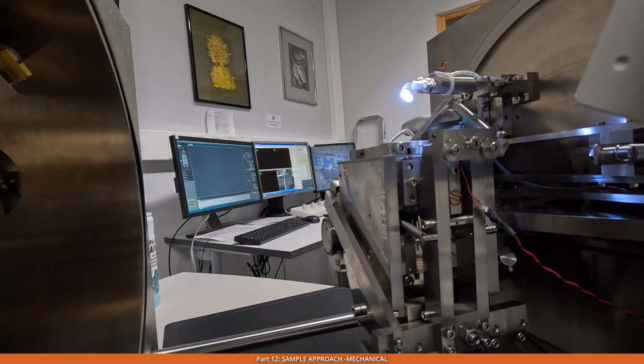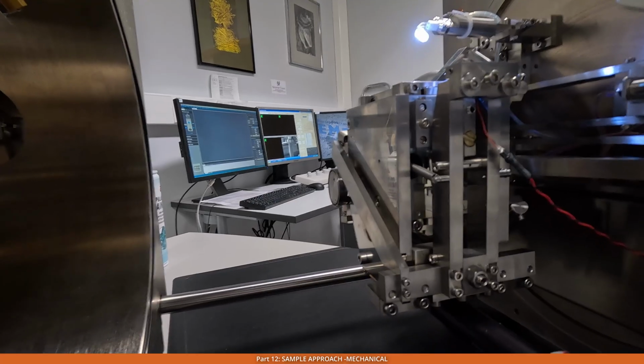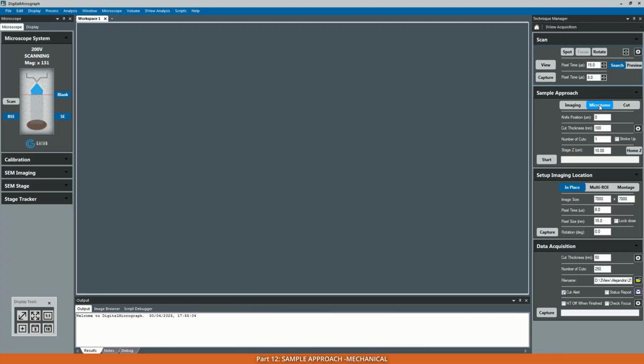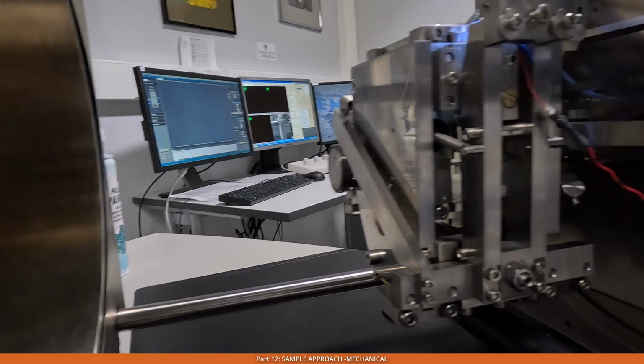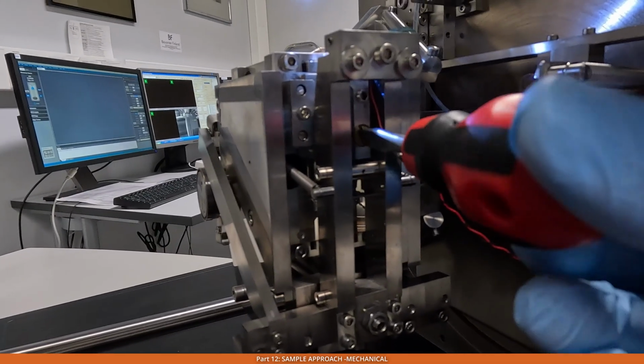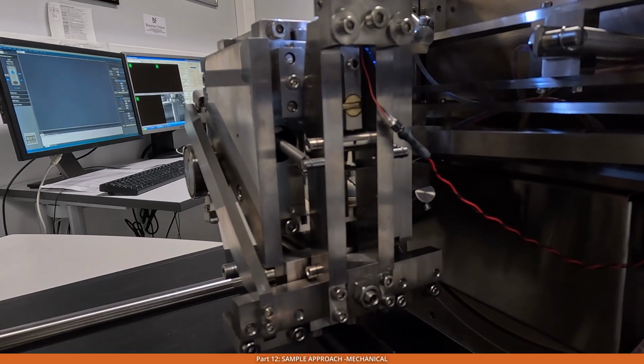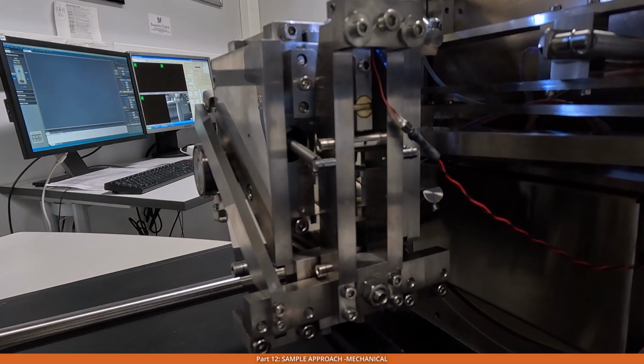Now we need to make sure that our stage is in the stroke up position. Go to the knife settings in the GMS3 and uncheck oscillator, and you can also make the speed of the knife a bit faster, to 0.4 millimeters per second, and then press the stroke up. And now we can lift the stage using the screw and the screwdriver up by monitoring the distance between the knife edge and the block face.